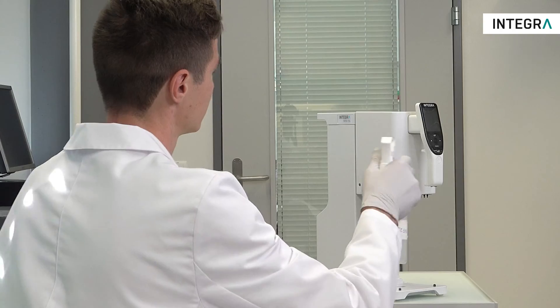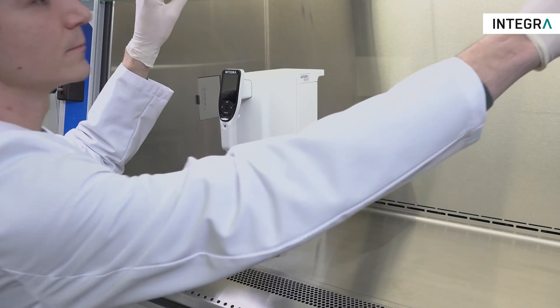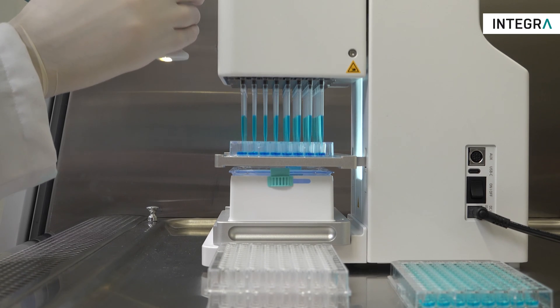The small size and portability allow it to be easily moved and used anywhere in the lab, from the laminar flow cabinet to the lab bench, and by anyone in the lab due to its extreme ease of use. Simply turn it on and start pipetting.